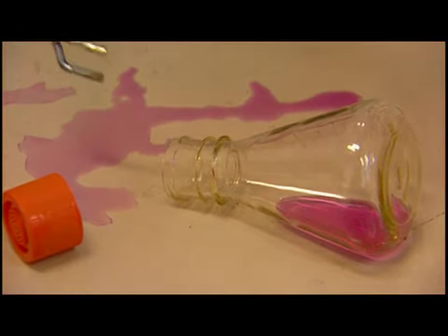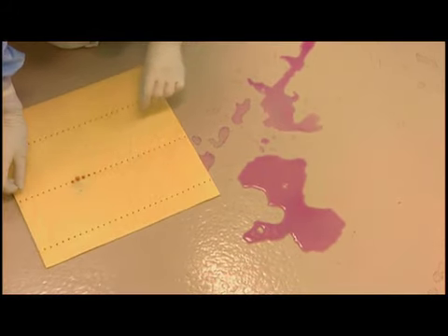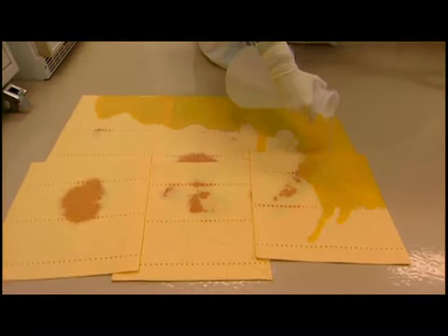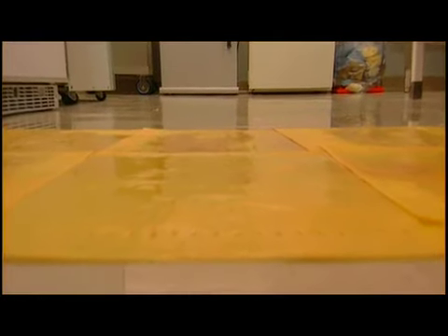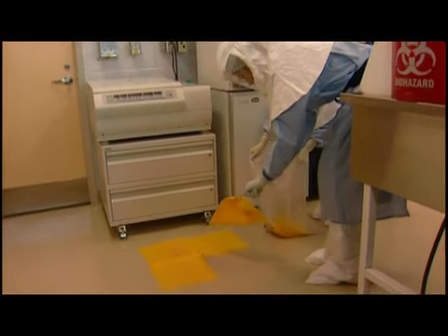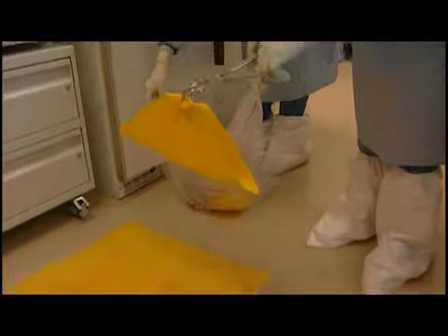Remember to use forceps to pick up and dispose of material appropriately. Use absorbent pads to reduce the chances of splashes when applying your disinfectant. Also, when decontaminating a spill area, always work from the outside towards the center of the spill. And always use the appropriate disinfectant at the recommended dilution and contact time. Always try to minimize air movement to reduce the creation of aerosols. Report the spill to your biosafety officer and complete an accident report.